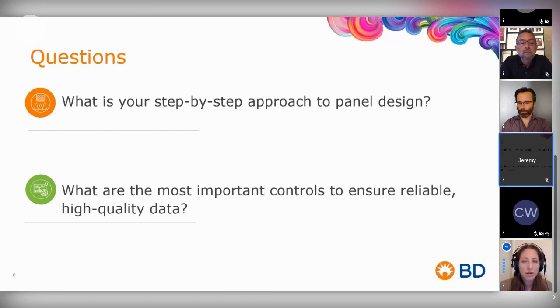And then it's very important to always titrate your reagents to really optimize the panel, and that includes the reagents and the way you use them. And we can talk a little bit more about that if you want. Of note, if you have a good collection of antibodies in your lab and they're already titrated, but there are different instruments that you could use, just make sure that the titration actually works for the instrument that you're wanting to work on, because the optimal titer can differ from instrument to instrument, particularly if there are different lasers involved.